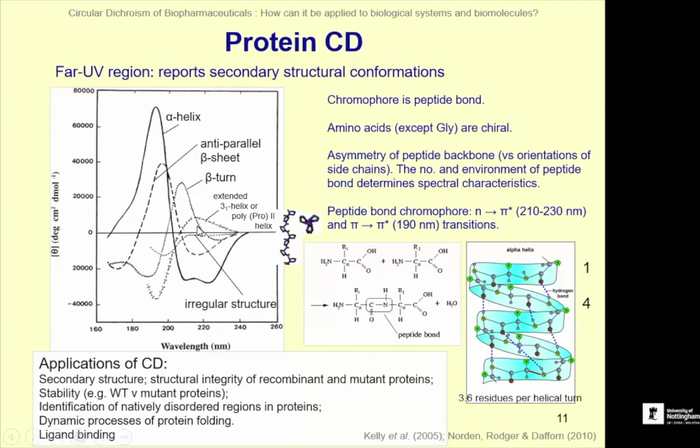Is that okay? So that explains why these are different, though they all have peptide bonds. They're all in different environments.